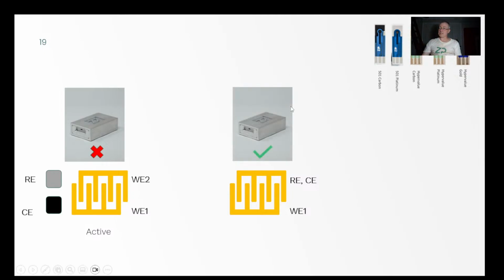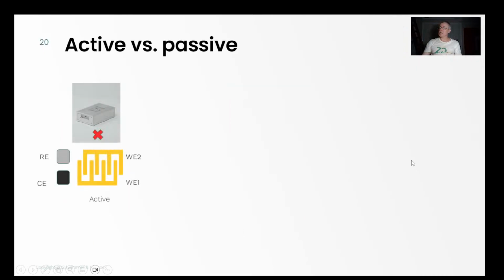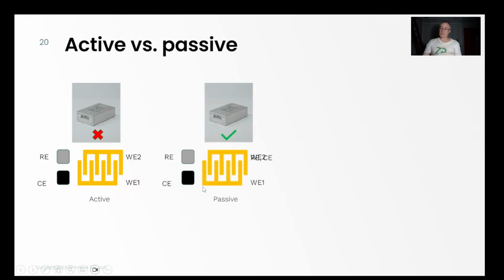In that particular case, this potentiostat will work. And depending on the chemistry that you're doing, it will actually work in a collector-generator mode. What I mean by that is, if you want to run 2 working electrodes where you're independently controlling their potential, then the Anapot EIS will not do that. But the Anapot EIS that you do have will do it when you've taken away the reference and counter, and you've just made the second working electrode the combined reference and counter.